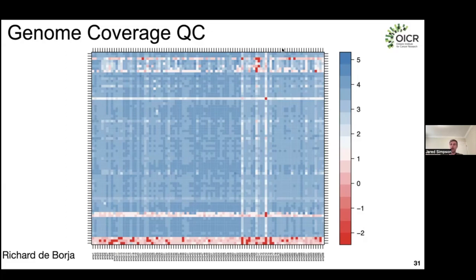This plot is automatically generated by the analysis pipelines we'll be working with, so we can assess whether there are problems with particular primer pairs or dropouts caused by SNPs.